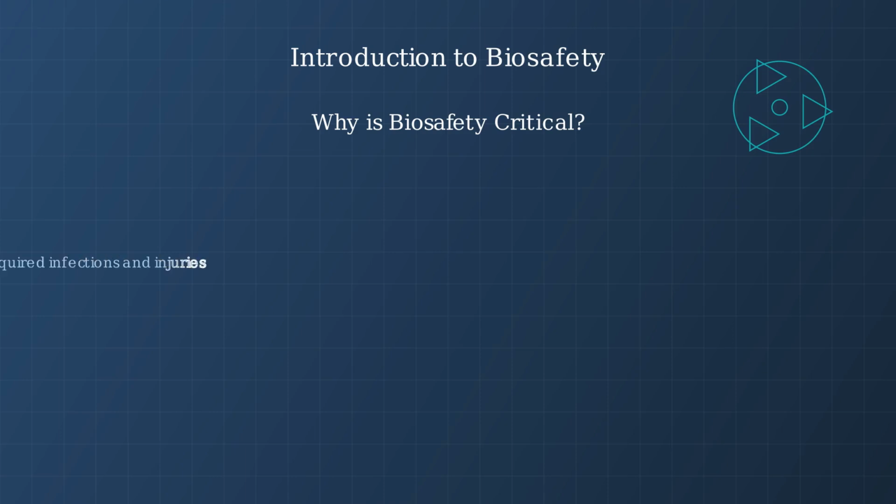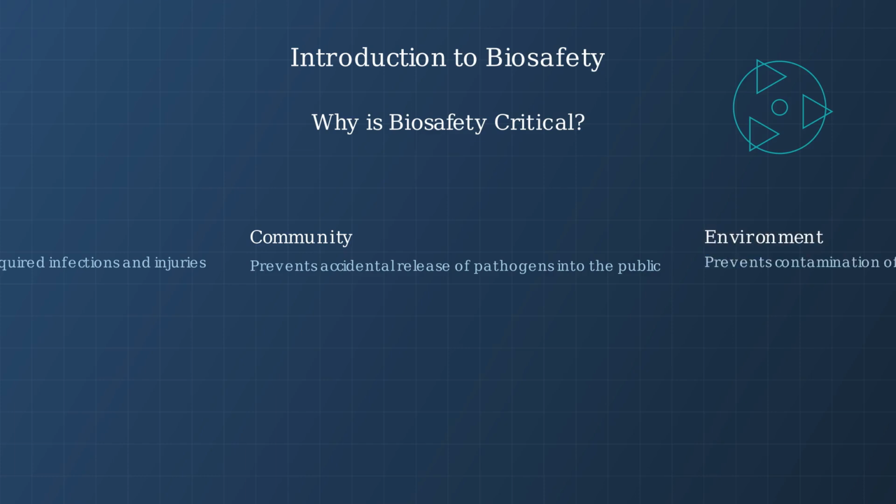First, researchers themselves are protected from laboratory acquired infections and injuries. Second, the surrounding community is safeguarded from the accidental release of pathogens. And third, the environment is protected from contamination that could affect ecosystems and wildlife.